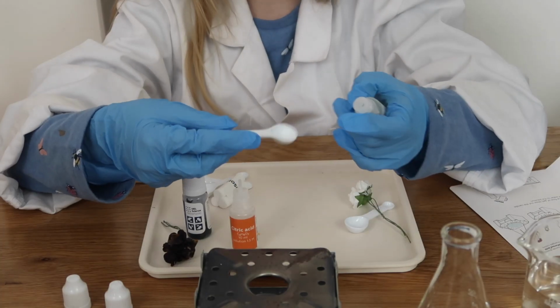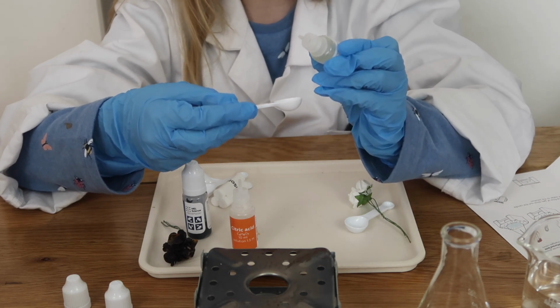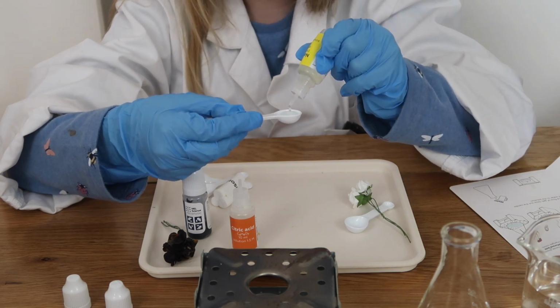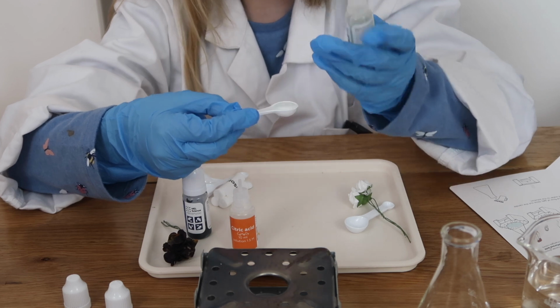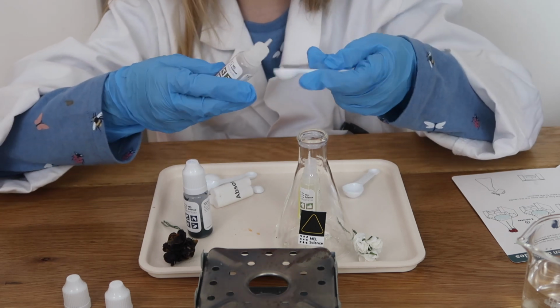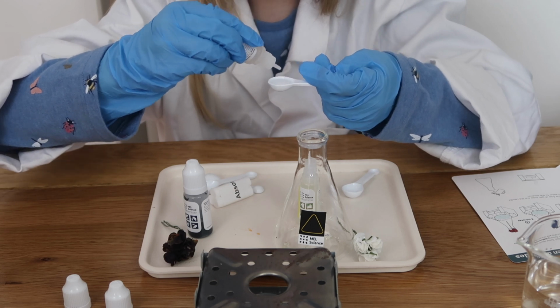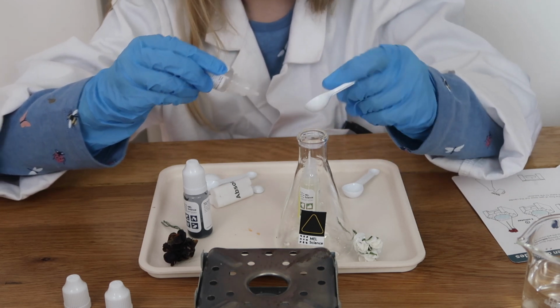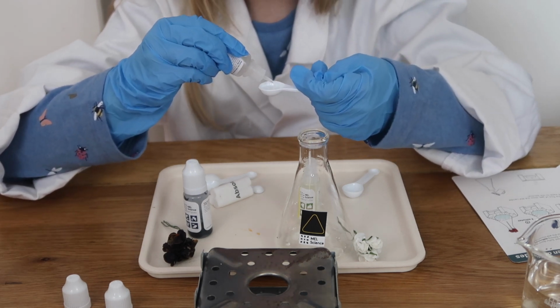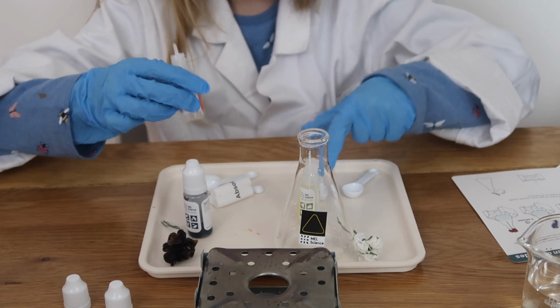Strange. So what I'm going to do is I'll add 1 large spoon of NASA. It's actually Na2S2O5, but it's spelled NASA. 1 big spoon, and then we add it. The next step is to add 2 big spoonfuls of citric acid. Carefully does it. Bloop. Add another one. And that should be done.